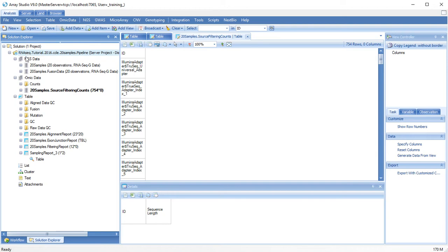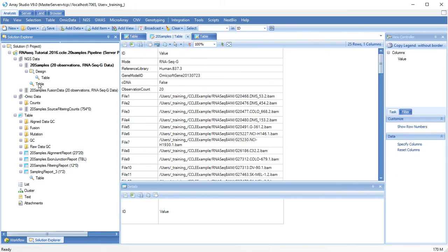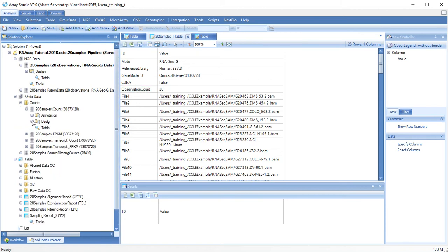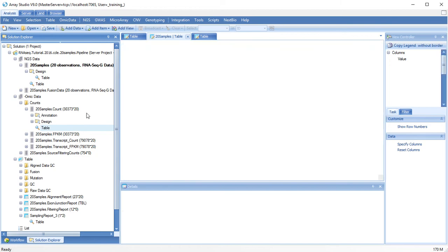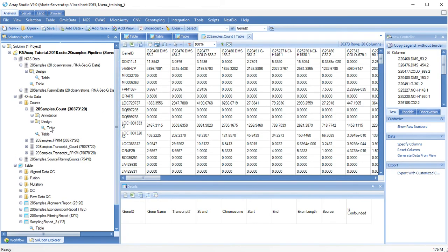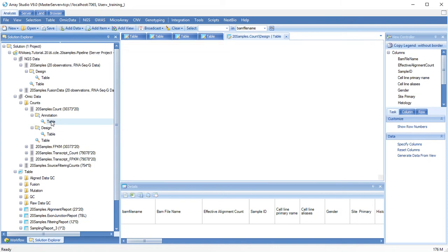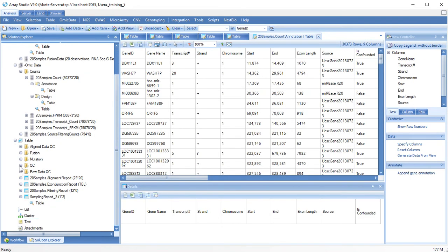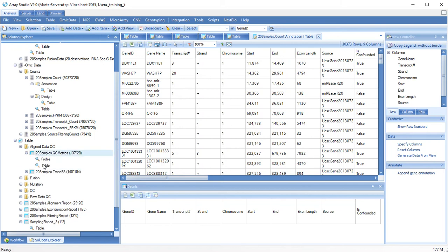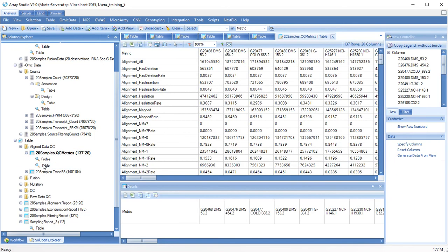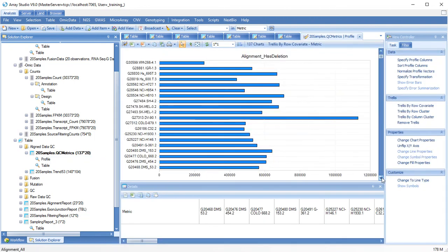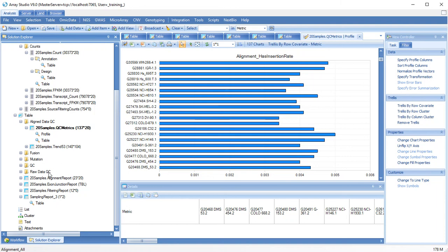Under your solution, you will find several data types. NGS data are pointers to your aligned BAM files. OMIC data are L-shaped data that contain some kind of quantification, along with associated design and annotation data. Table data are simple data formats, along with attached views, and you might also have list or other types of data.